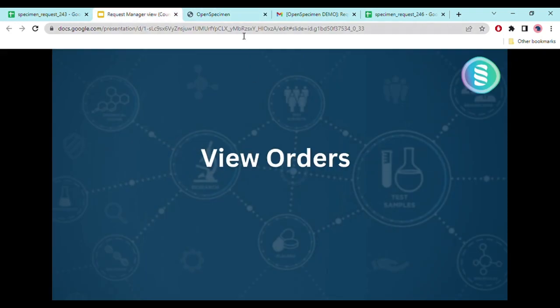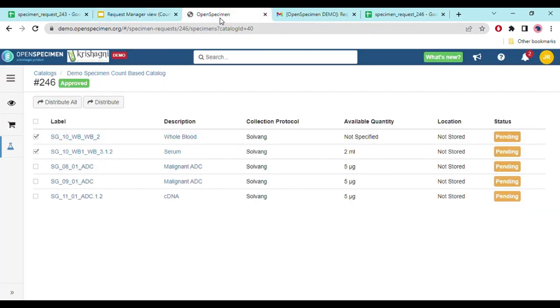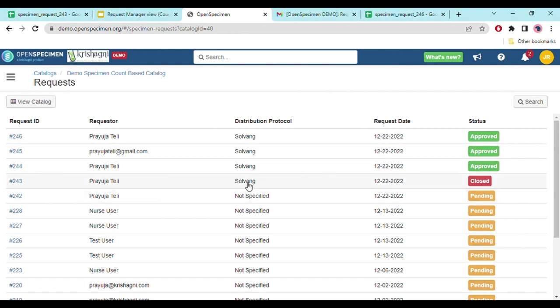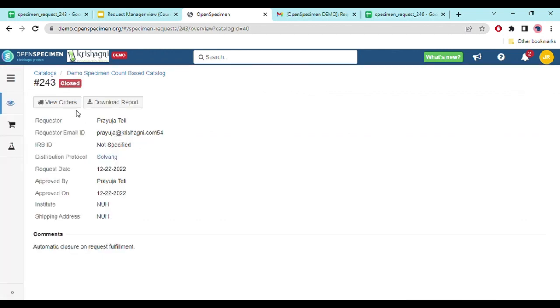And the last part of this video will be view orders. Once you approve and distribute all the samples, the request will get marked as closed. And then from here, you can either download a report or view orders. The downloaded report looks like this.